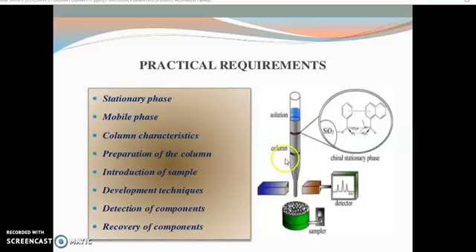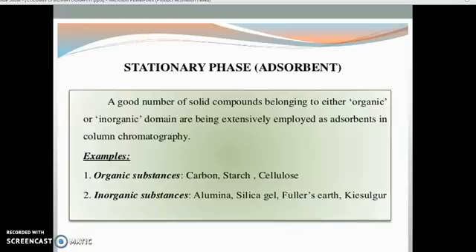You can detect it using a hyphenated unit such as an HPTLC system, and the eluted components can be screened and scrutinized using their peak height and peak width. So these are the experiments we need to perform in this way.